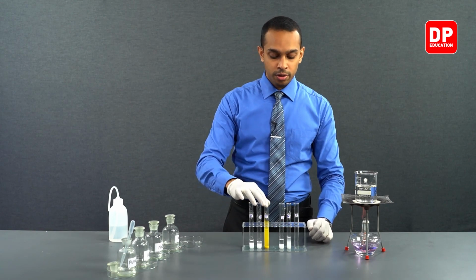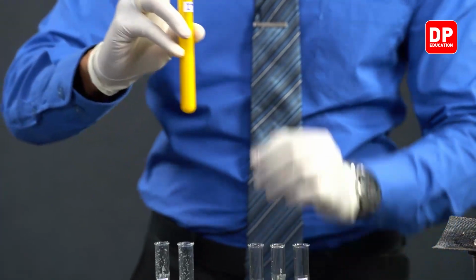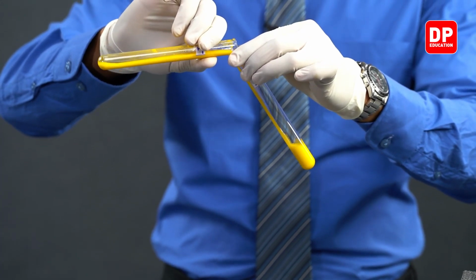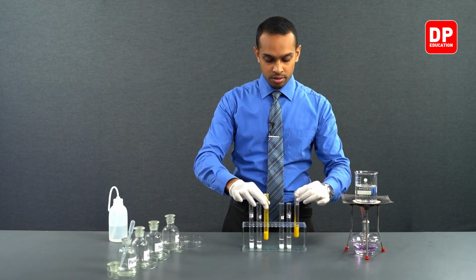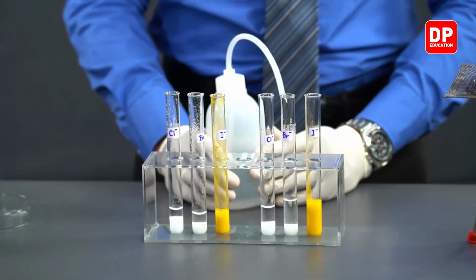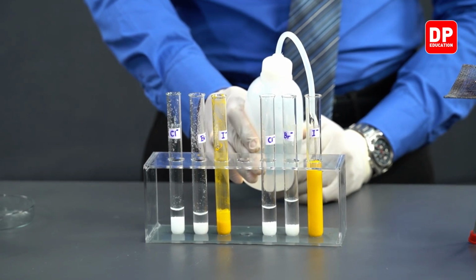And finally, we'll do the same with lead iodide as well. We'll take the lead iodide and mix it quite well and transfer some of the lead iodide suspension into a different test tube. Now that we have separated it into different test tubes, let's dilute them by adding a little bit of water. So to each of these test tubes, I'm going to be adding a little bit of water to dilute them further.